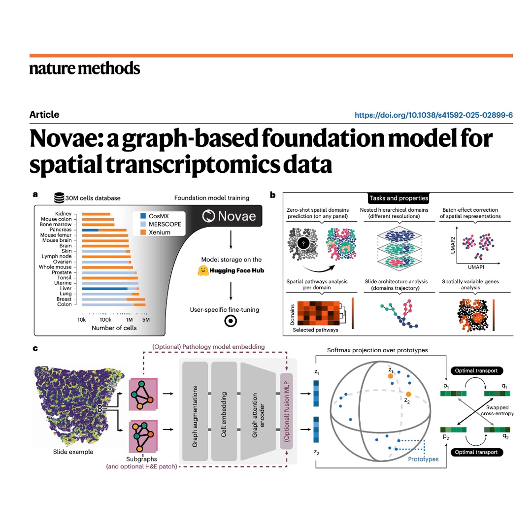Now, here's the problem, and it's a big one. As ST technologies like Xenium, Merscope, and Cosmx have gotten better and better, the data sets have become, well, a nightmare of complexity. A total nightmare. We're talking millions of cells spread across dozens of slides, all run on different machines, maybe even using slightly different gene panels. So that's the core challenge. How do you integrate nearly 30 million cells across 18 completely different tissues, from the brain to the lung to the colon, and still pull out meaningful, unified knowledge? And knowledge that isn't just an artifact of which machine ran the experiment.